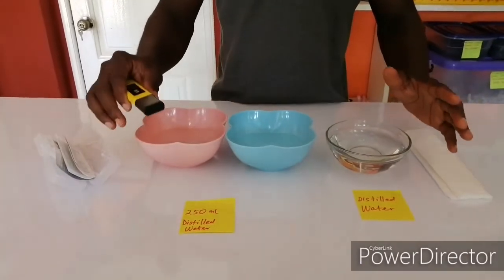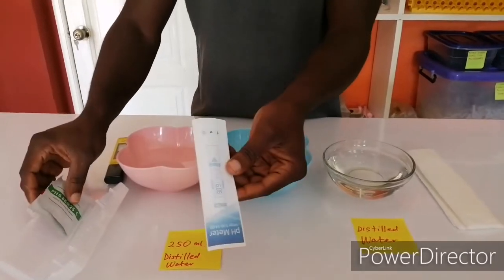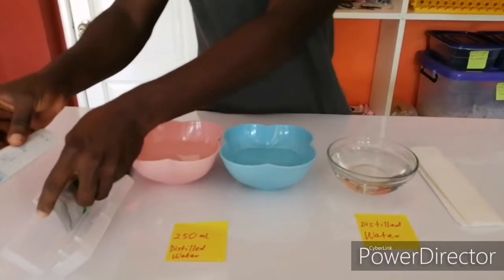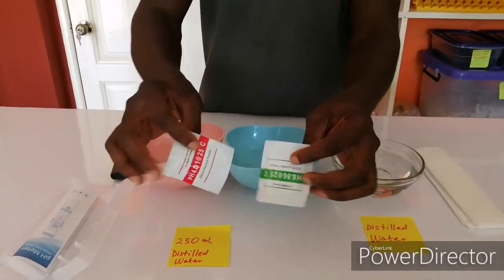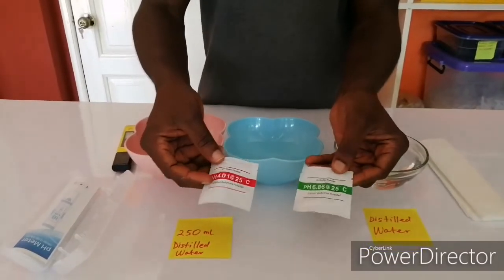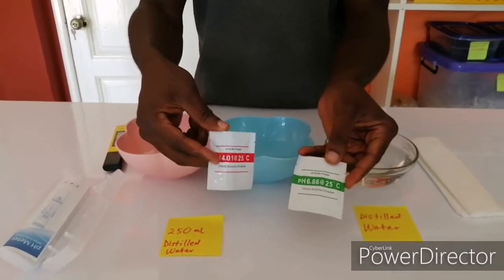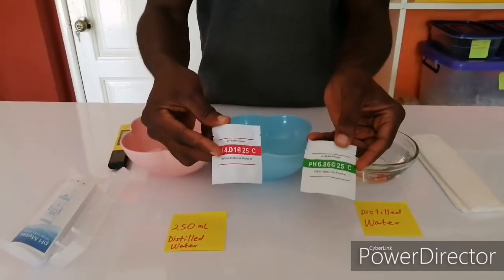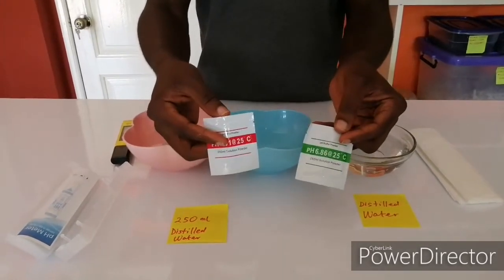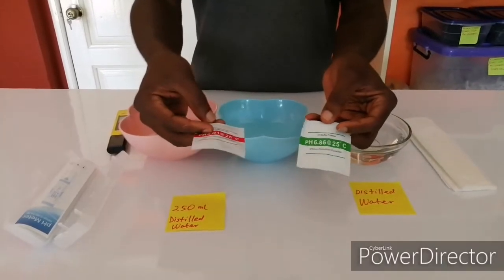I'm going to take you through how to calibrate it. When you buy your pH meter, it comes with a user manual and two buffer powders. I will leave the link down below so that you can click and then buy the exact same type of buffer powder. You need extra buffer powders for a failed calibration or for subsequent calibrations.